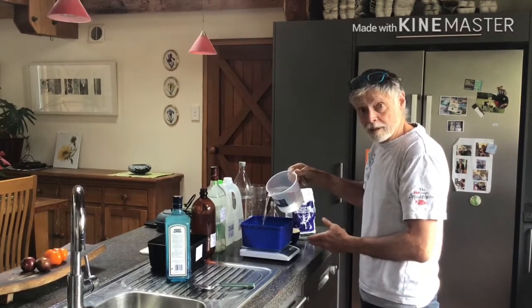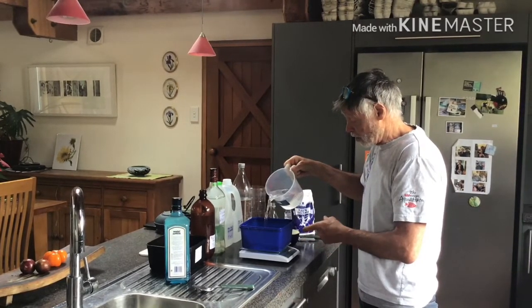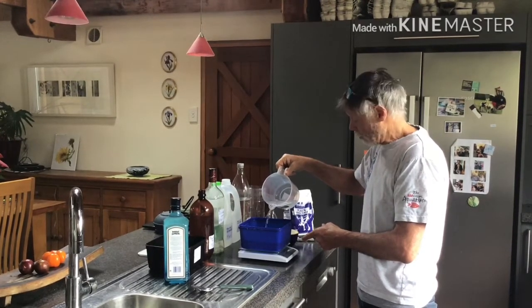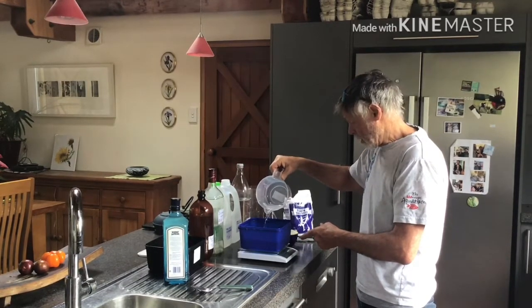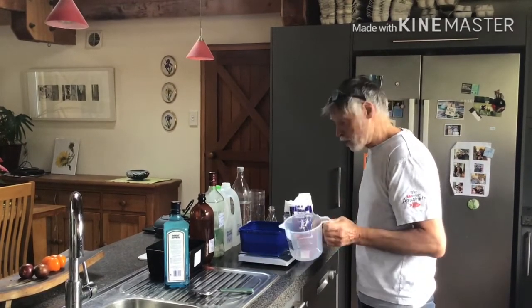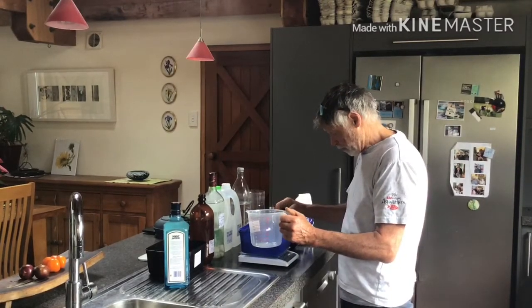Not only is it precise, it's more accurate, because these scales are going to give us maybe plus or minus 1 gram, rather than, when I did it with volume, getting a positive bias towards 1,005 grams as my average.